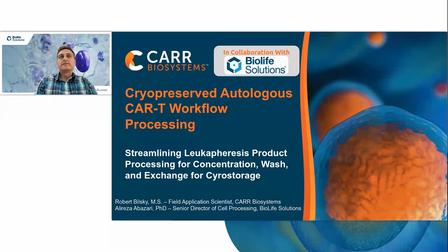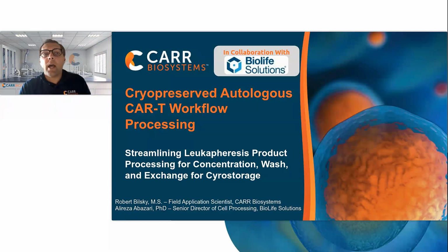Thanks, Ali Reza. So today we'll be speaking on the cryopreserved autologous CAR T workflow and how leukapheresis product processing can be streamlined across concentration, wash, and media exchange for cryopreservation.